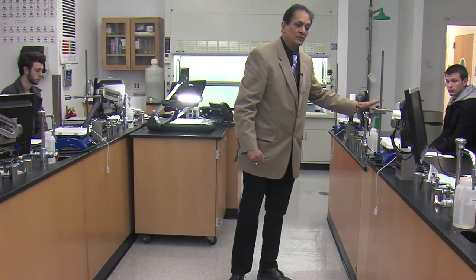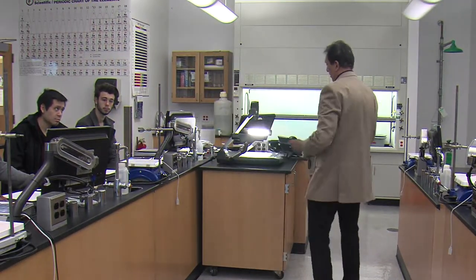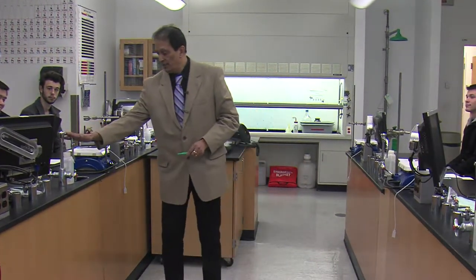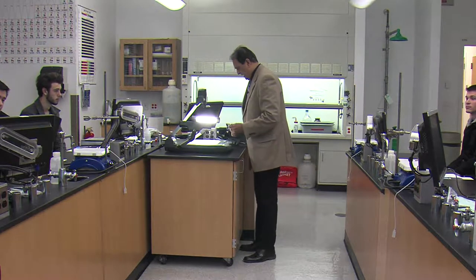These in front of you are not faucets, all right? So do not even use these. They will spray water on you and you will have a free shower, okay? I don't know why these are here, but do not use these, right? That's the only faucet and the sink that we have.